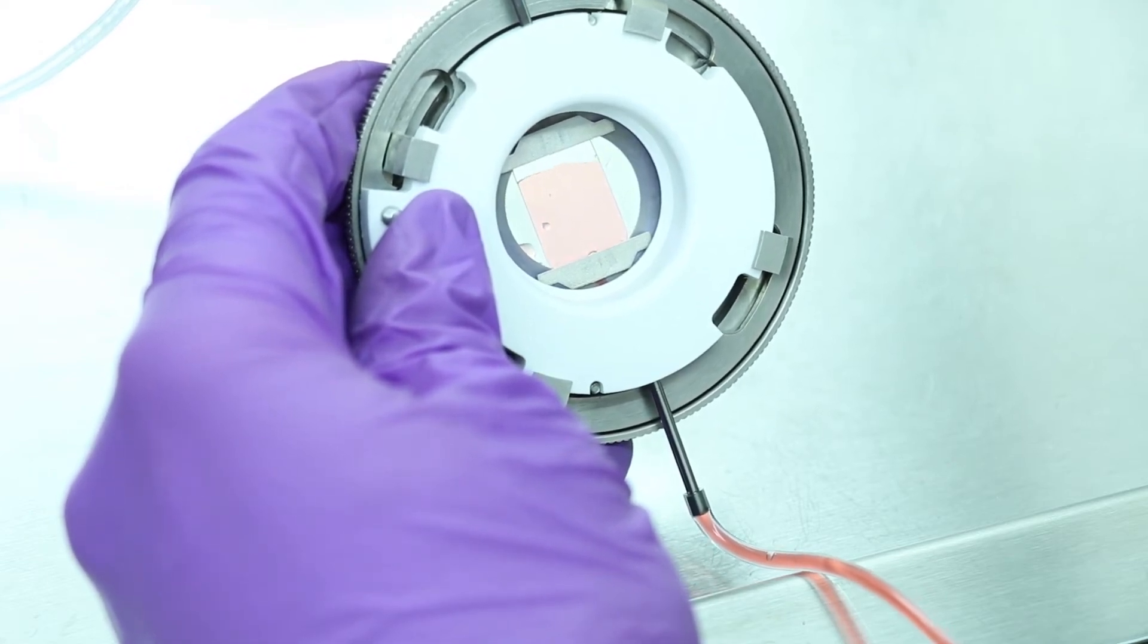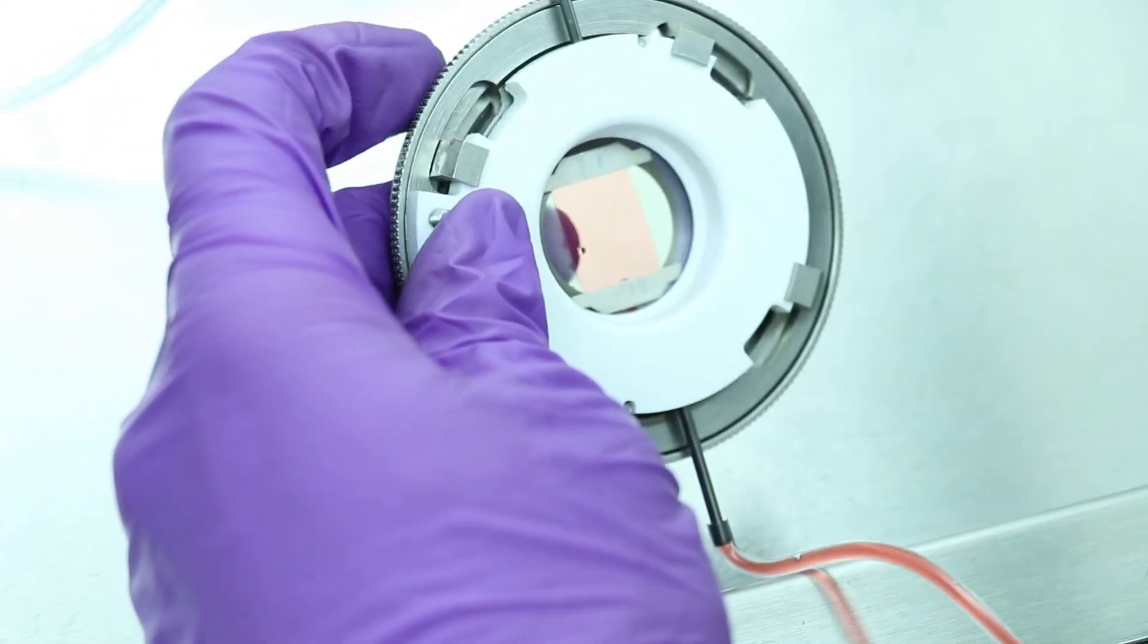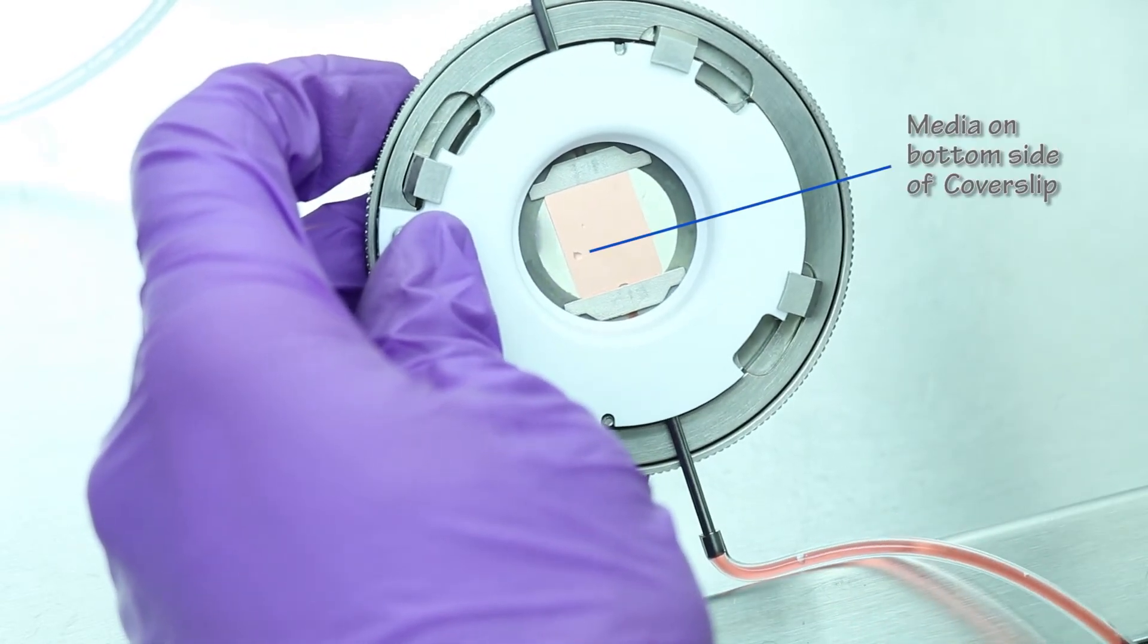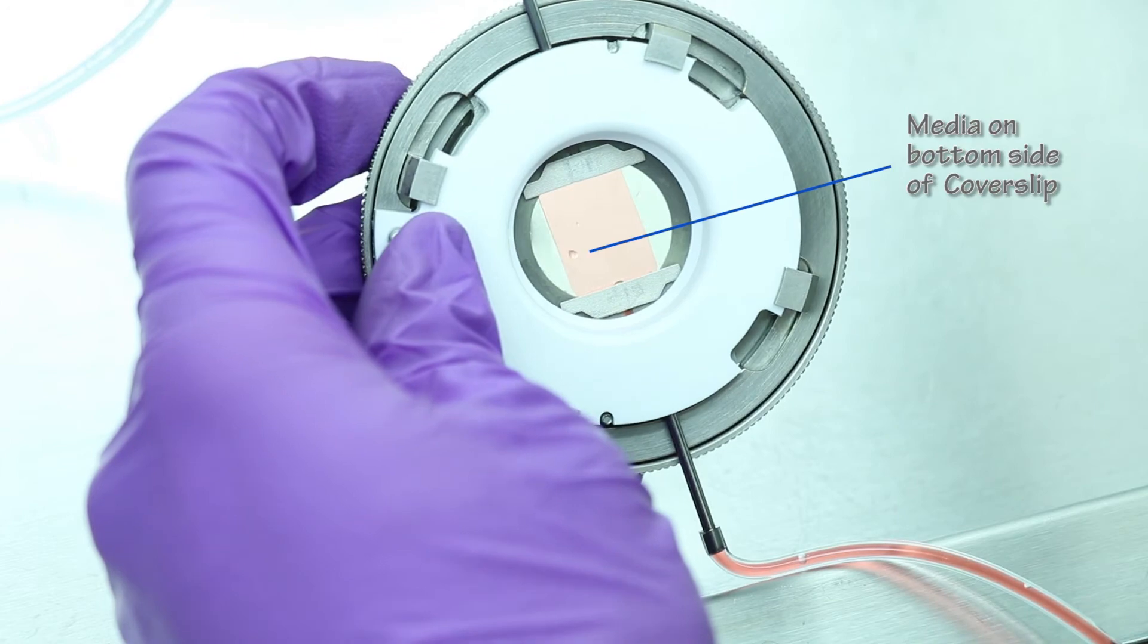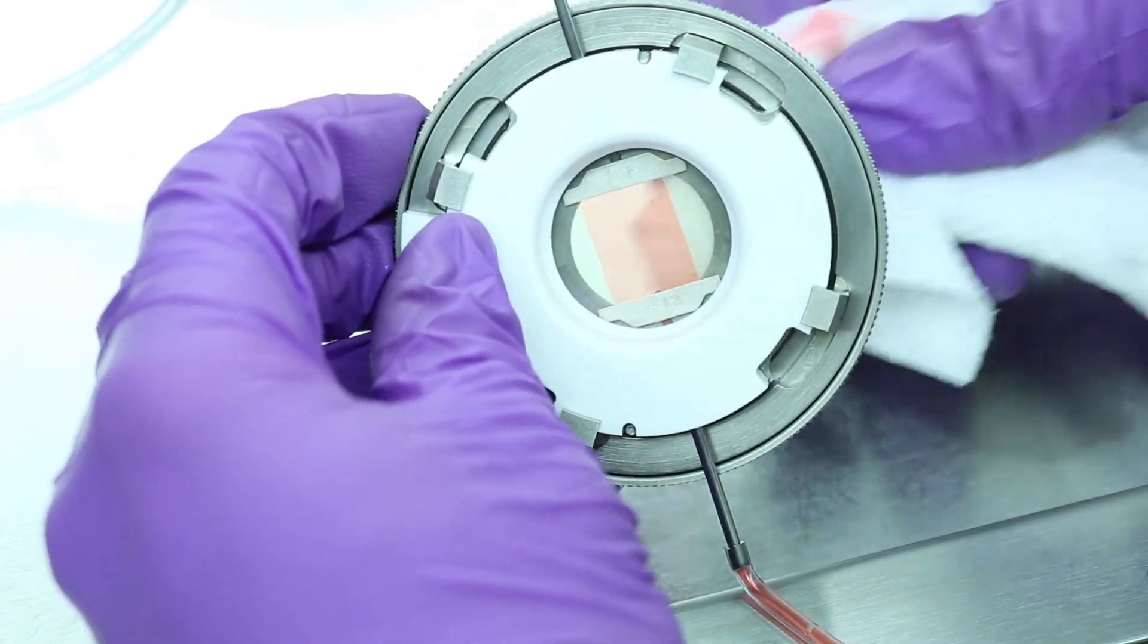If air bubbles are present, you can simply tap on the chamber while perfusing and air bubbles will clear. Wipe the additional media from the cover slip to prevent any media from contacting the microscope or dripping.